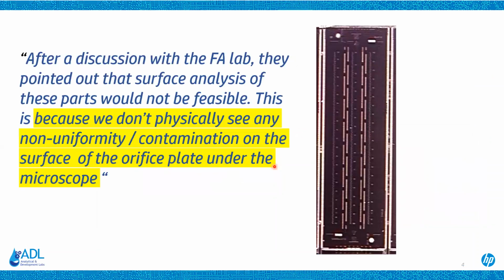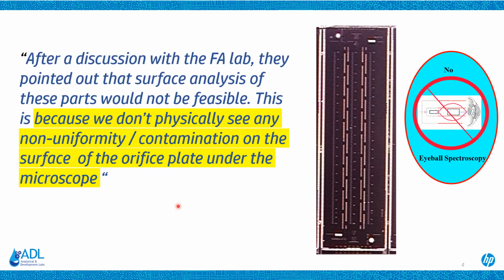One of the other things we, of course, deal with, and all of us do who are listening to this presentation, is the fact that pretty much what we work with, you can't see. And so you often get emails that have this kind of phraseology in them. And as we all know, we don't really want to use eyeball spectroscopy. So for example, this orifice plate that I'm showing here is made out of palladium, and it's also covered with Teflon, and you simply can't see that with your eyeball.